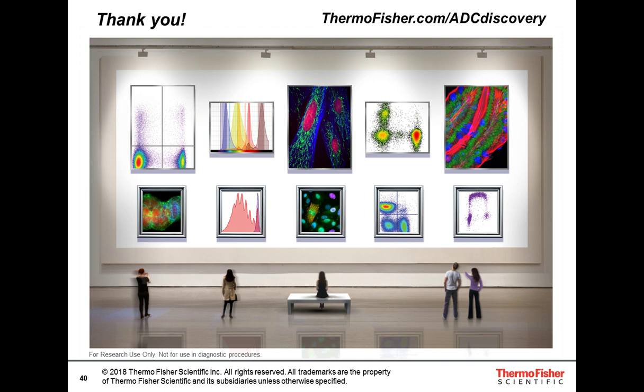Yeah, it's true. So the beta-galactosidase is used for many protein chemistry and biological research methods. In this case, the 2 enzymes, the beta-galactosidase and the galactosyltransferase, are specifically engineered for this purpose. So not just any enzyme can perform this function. We've actually had to do a significant amount of engineering to create versions of these enzymes that will perform in this manner. So thank you for the question.